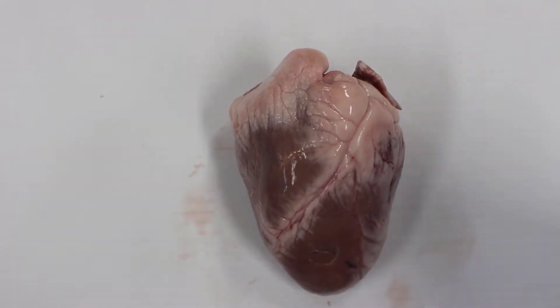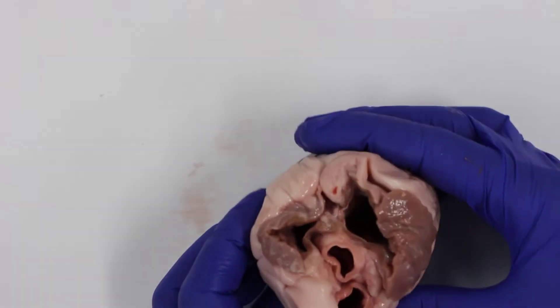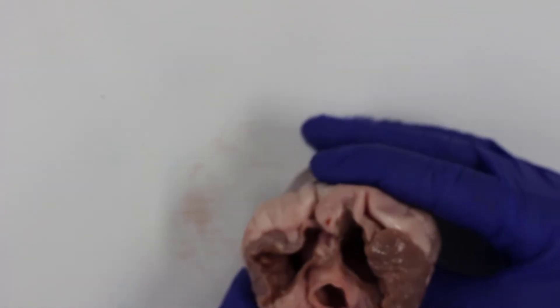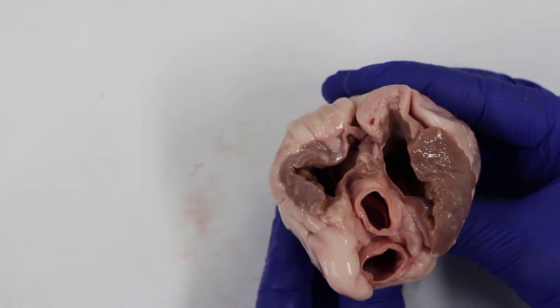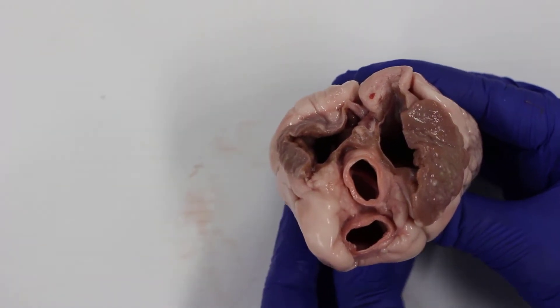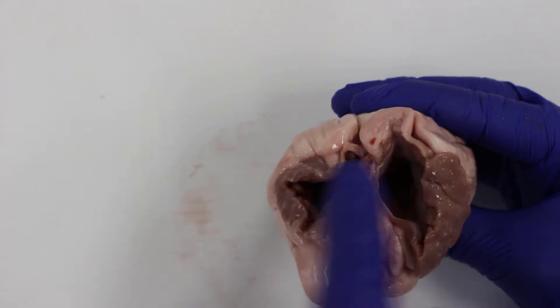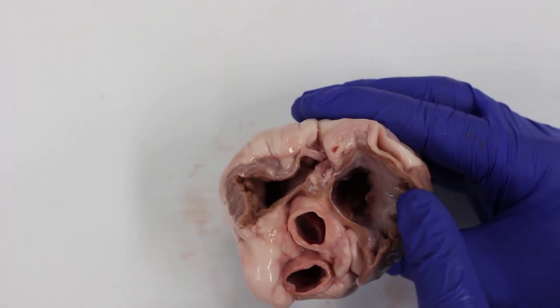The coronary artery supplies blood to the heart muscle, because the heart is a muscle and needs blood to keep pumping. All the vessels going in and out of the heart are at the top. There are two vessels that are whiter in color and a bit smaller — those are arteries. Arteries carry blood away from the heart and have thick walls because the blood is under high pressure.